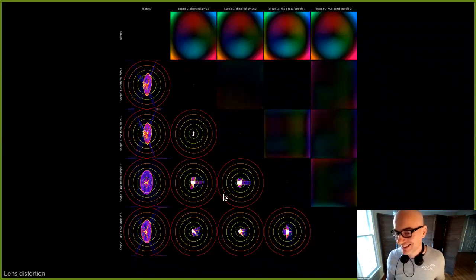That's great. If it exceeds it slightly, like in this example, then it goes beyond 1 pixel, and the question is then, where does it do this? And for this, you can refer to that plot here, where you see that okay, there's a little bit of stuff going on in the periphery, but then the center is mostly black, so that's fine.